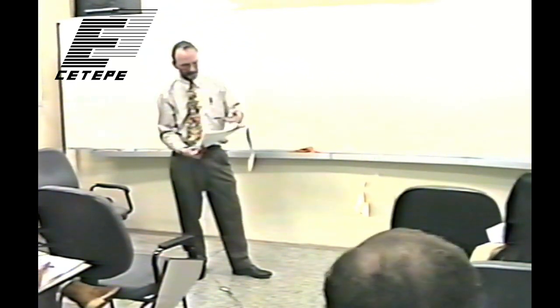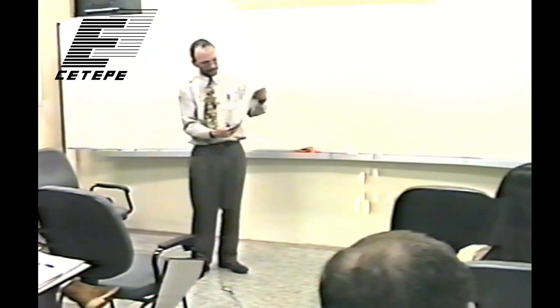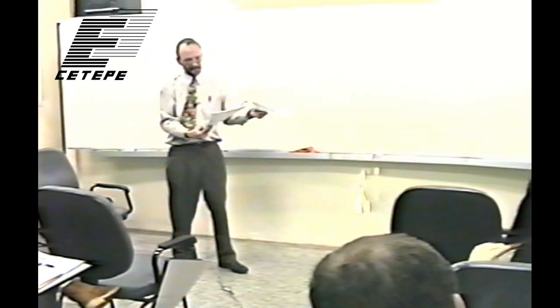And then he talks a bit about each of these types of noise. And then the last chapter is basically quality control types of things to maximize the image quality. I included that mainly because of the section starting on page 455, or actually just before that, on page 453, where it starts talking about contrast response. There's a very nice little discussion of the modulation transfer function that we're going to talk about now.